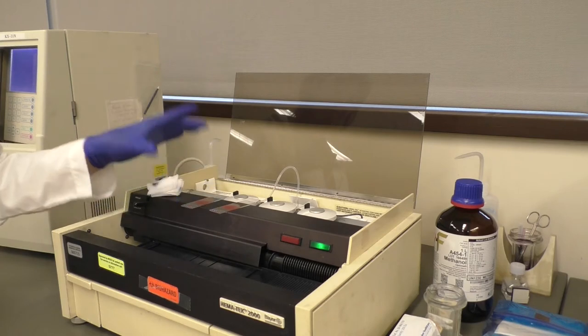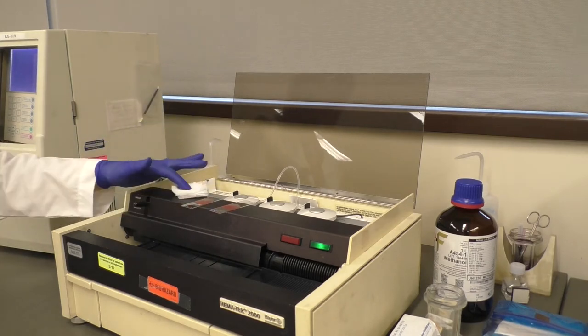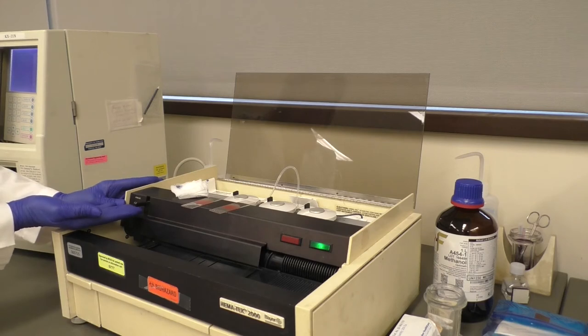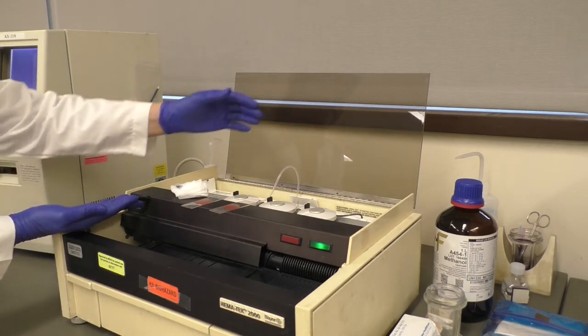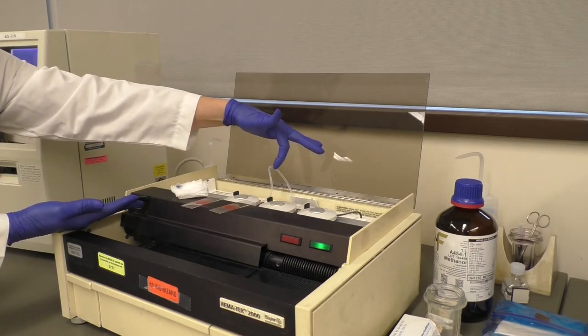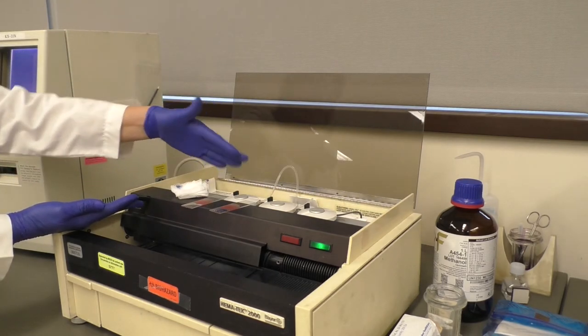The first portion of this procedure is priming. First, lift and hold the operating lever to the top position to prime. Hold in this position until the stain, buffer, and rinse solutions flow evenly through their tubes without any air bubbles.